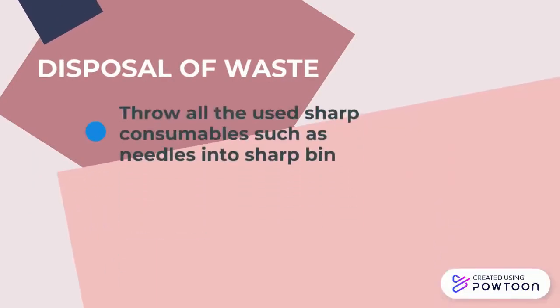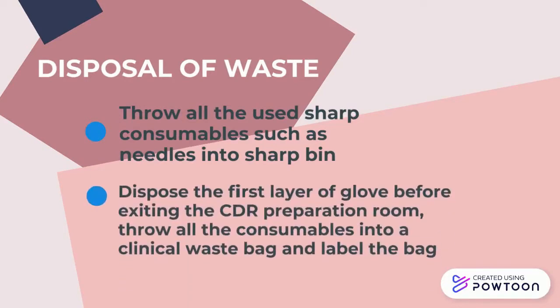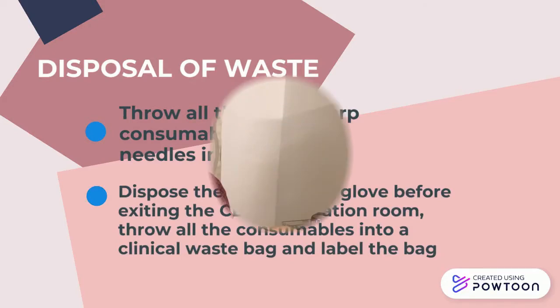Disposal of waste. Throw all the used sharp consumables such as needles into sharp bin and dispose the first layer of glove before exiting the CDR preparation room. Throw all the consumables into a clinical waste bag.